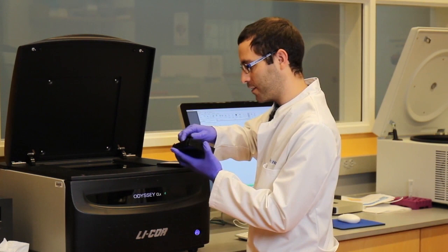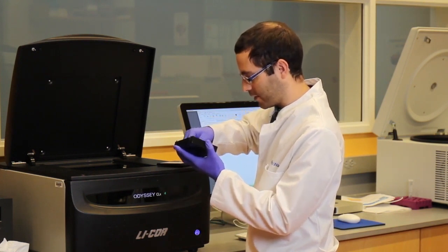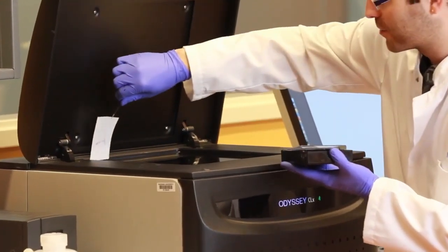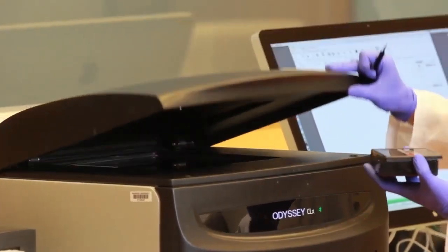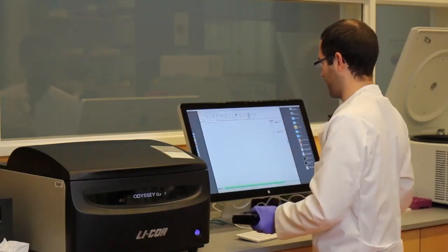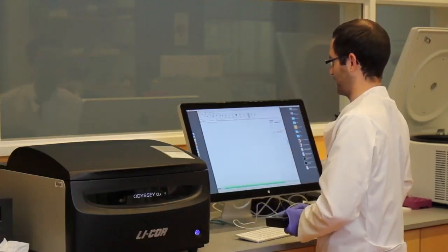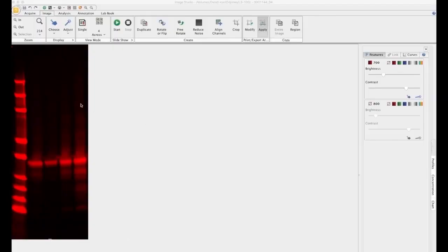So we'll take our membrane, again using the tweezers, make sure to place it on the imager upside down so that our protein side is facing the bottom. Close the lid and click acquire. Okay. And here's our final image of the Western blot. We see our protein ladder nicely showing up over here. And these four lanes now show the bands that we couldn't see before. This right here is our protein of interest, which looks very nice in the first three lanes. Maybe a little bit of degradation in lane four, but it's still there. I'm happy with this Western blot.